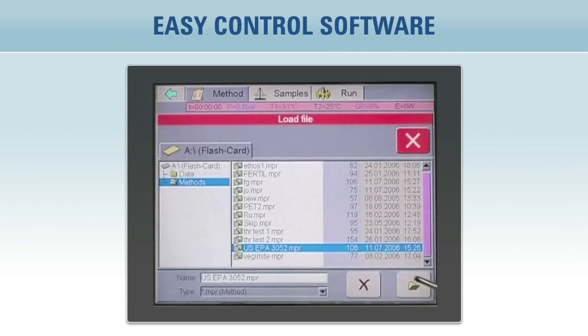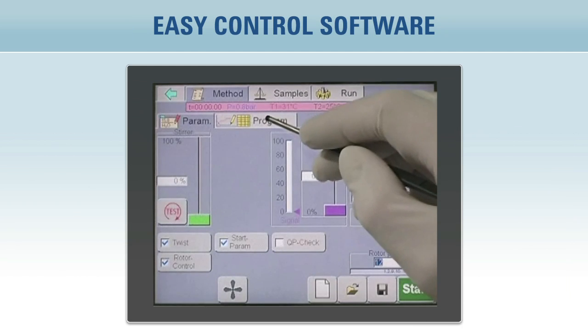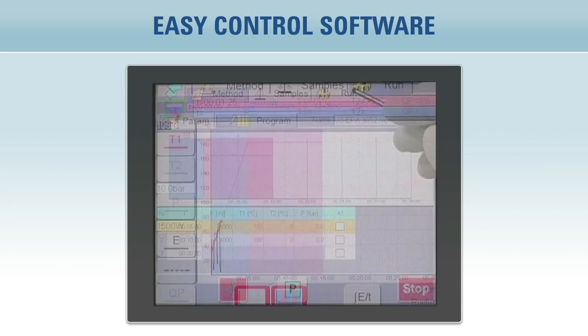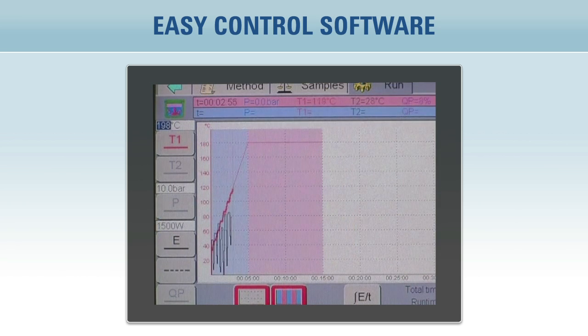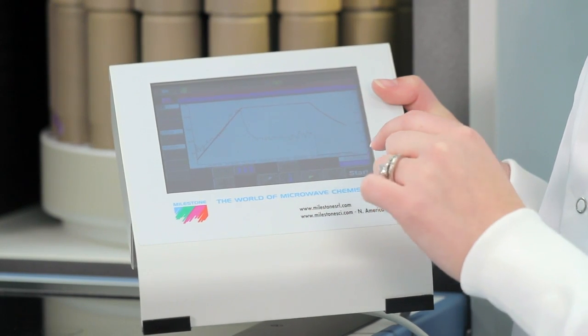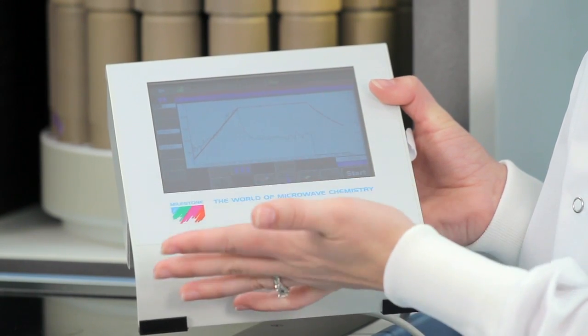Operation is simple. Simply select the time to temperature and the time at temperature — no need to set the microwave power level. Easy Control's PID controller monitors the temperature 20 times per second and automatically adjusts the power setting to follow the desired temperature program.